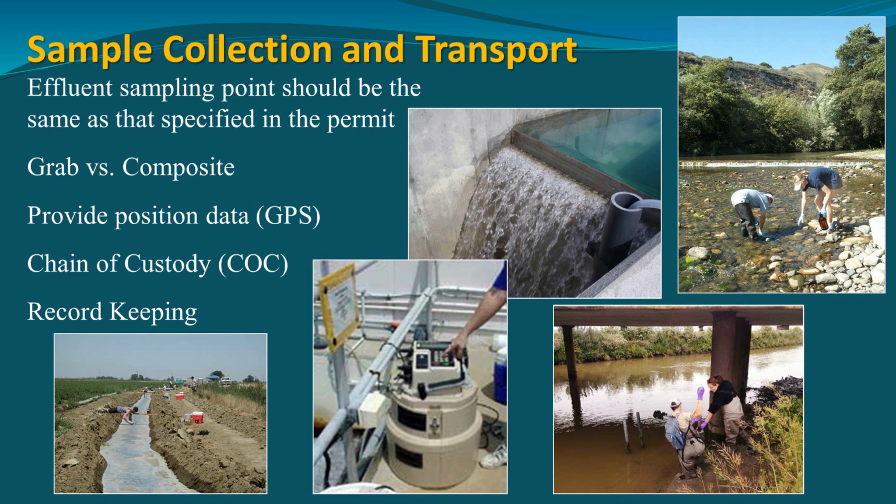This is some of our spot sediment collection. Similar concept, except we're collecting the mud from a receiving system instead of the water from a receiving system. Here's a grab sample going on in a fairly pristine receiving system. This is one of our reference sites for a program we did a few years back. And we're collecting just single grabs of the sample, so it's more of a snapshot than the composite sampling.